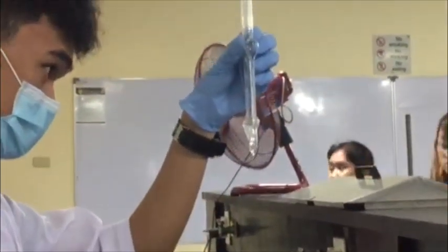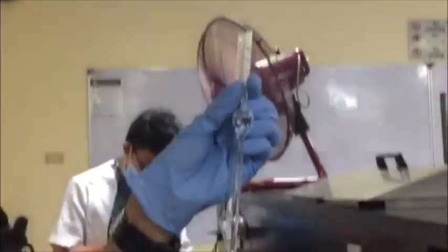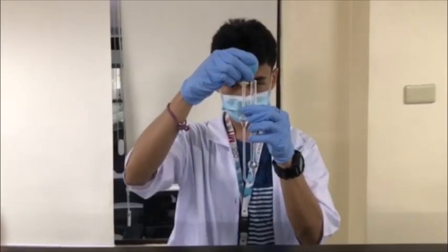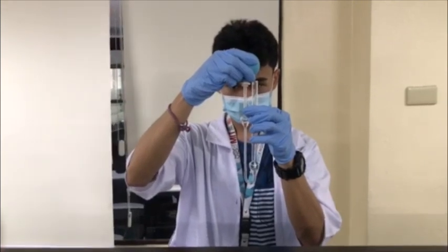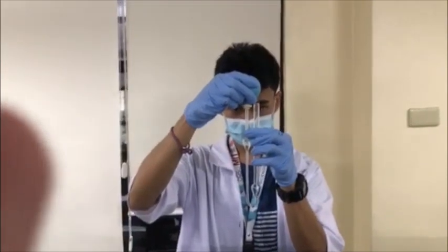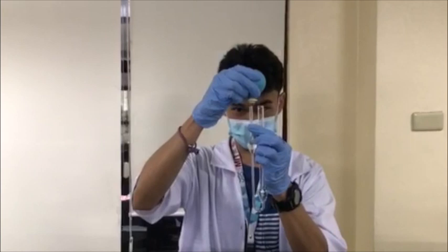All 3 parts of the experiment followed a similar process as in that of the calibration of the viscometer, and a total of 2 trials were done for each sample. The first part of the experiment involved determining the effect of intermolecular forces on viscosity. Here, the viscosities of water, ethanol, ethylene glycol, and 1-butanol were computed.